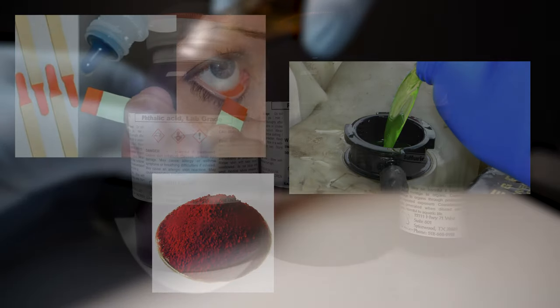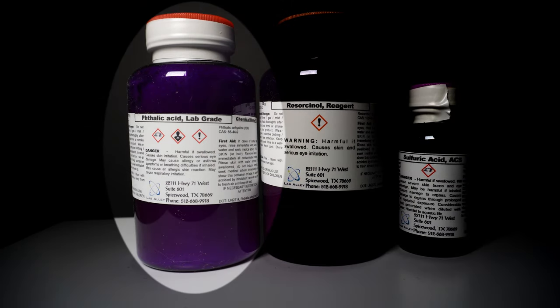But enough on that, let's get started. The three main starting materials I am using are phthalic anhydride, which is commonly used in the production of dyes, resins, and plastics.